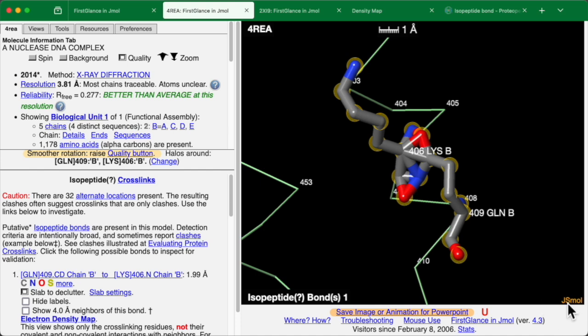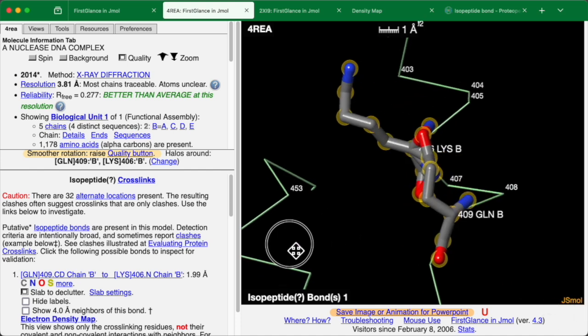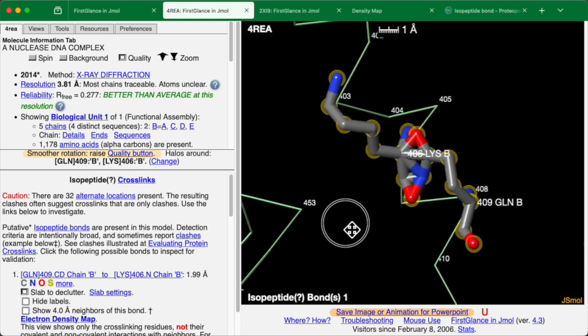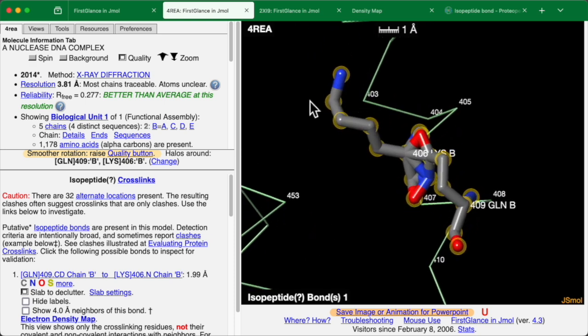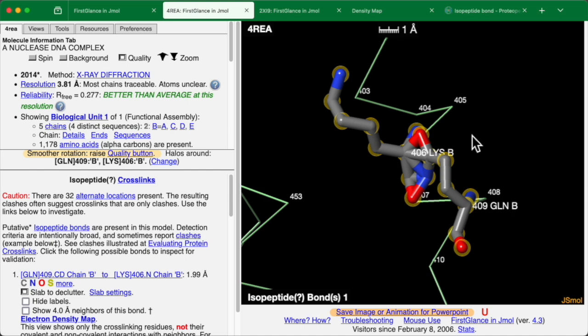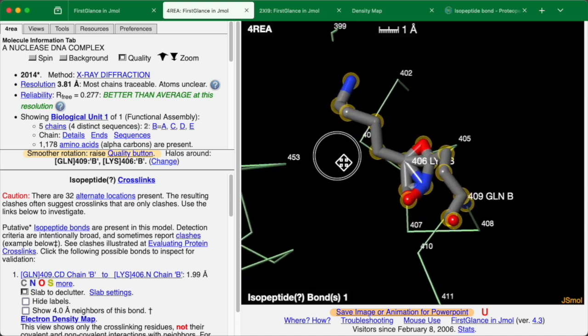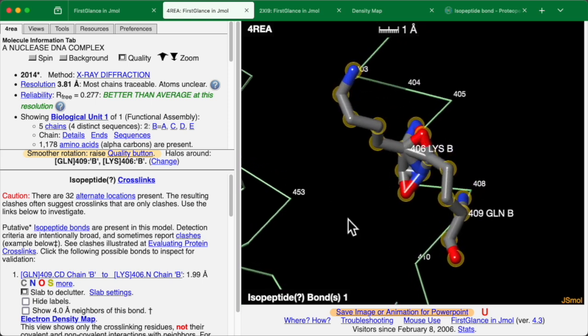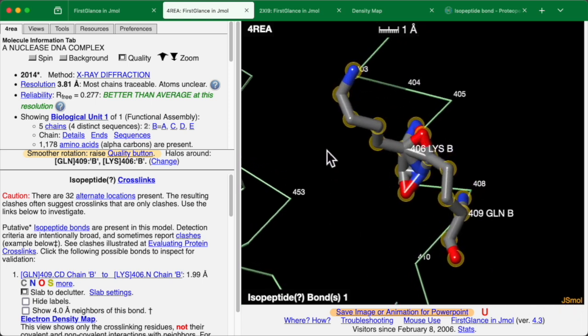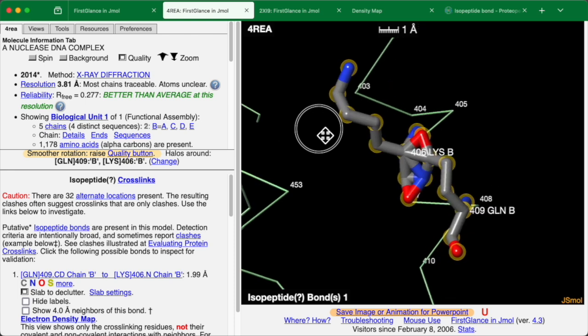It should be pointed out that Jsmol, the program that renders the molecule in FirstGlance, assigns or draws, let's say, sticks wherever two atoms are the right distance from each other for a covalent bond. The information on where covalent bonds are in the model is not in the model data file. It's up to Jsmol to figure that out. In this case, the atoms are in inappropriate places. And so we get this kind of a mess.